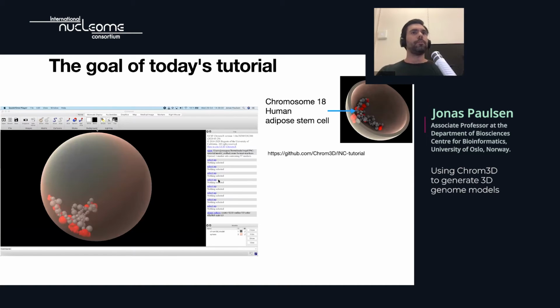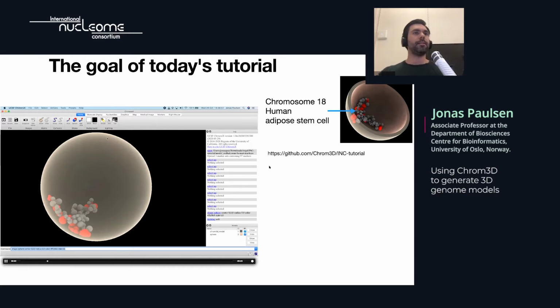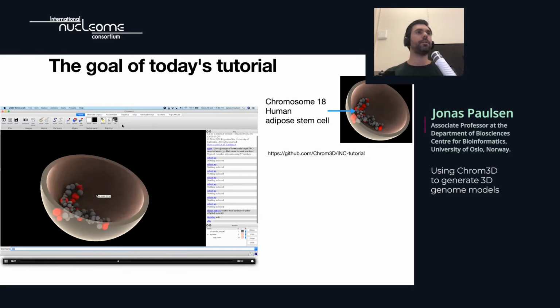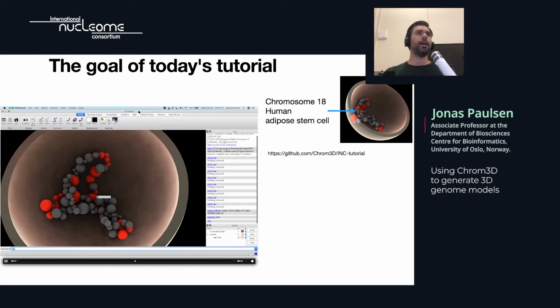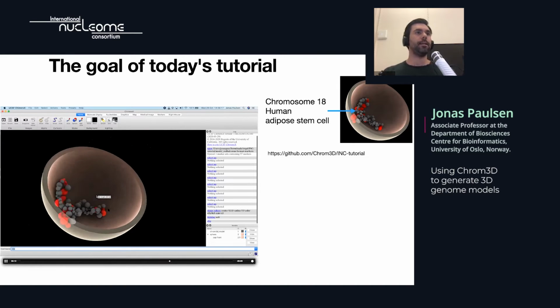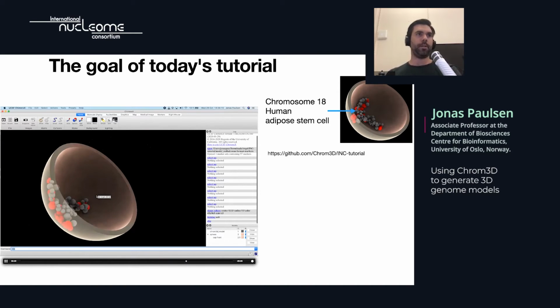The goal of today's tutorial is actually to make what I've tried to show you here in a video, where at the end of today's session, maybe in a couple of hours, we should be able to use the ChimeraX program to interact with a model of, well, what we're going to study today, which is human chromosome 18, which is what you can see here.